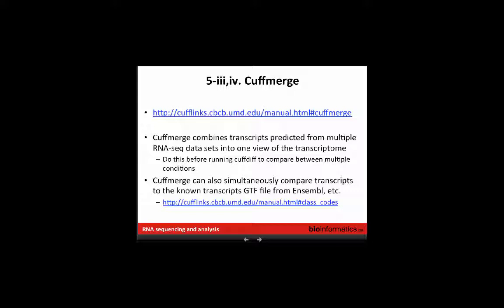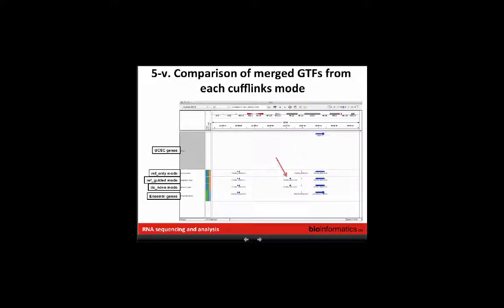We're going to run CuffMerge again, combining transcripts from multiple datasets into a single unified union view of the transcriptome before running CuffDiff. We'll also supply it with a GTF file of known transcripts so it compares all predicted transcripts back to the known transcriptome. CuffMerge assigns a class code to each predicted transcript that tells you how novel or known that transcript is — descriptions of those class codes can be found in the Cufflinks manual. We'll load results into IGV and compare GTFs from each Cufflinks mode.